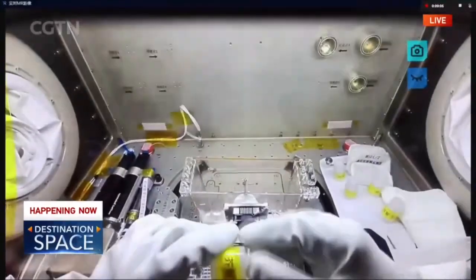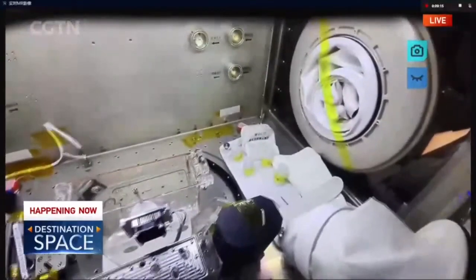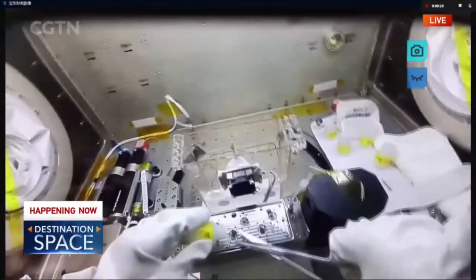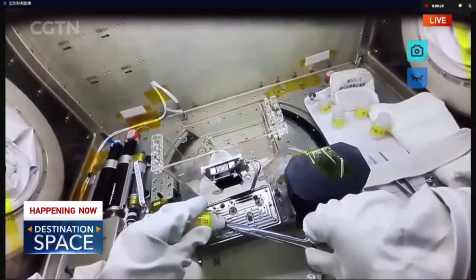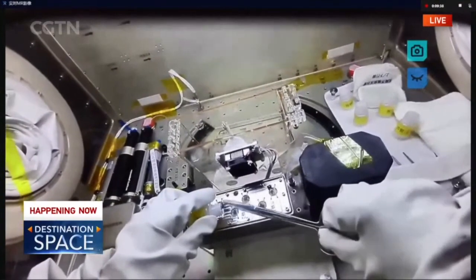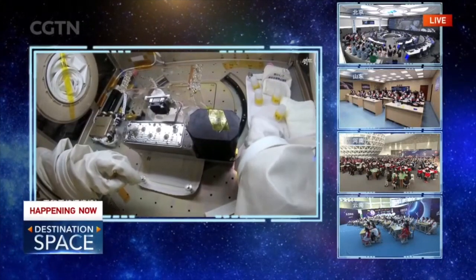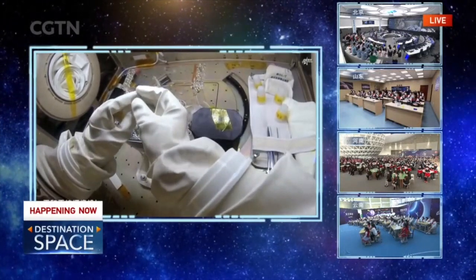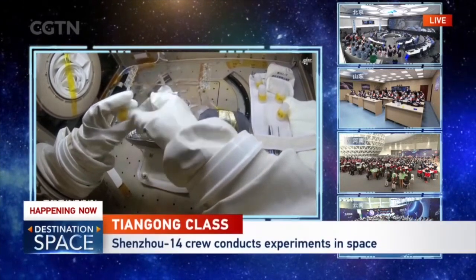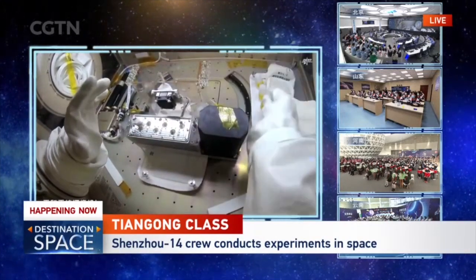Now I'm able to pick some of these Arabidopsis. First, I would like to open the cover. Use the scissors. I will start from this one. Put the cover back and take a look. So this is one of the samples of the Arabidopsis.